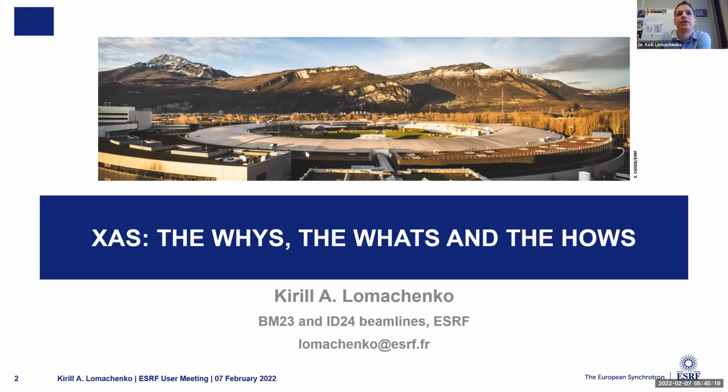So Roman Werner asks, what are the different aspects of L and K edges for 3D metals? The difference between different edges is where the excitation comes from, so where the core hole is and what empty states are filled, what empty orbitals you probe.